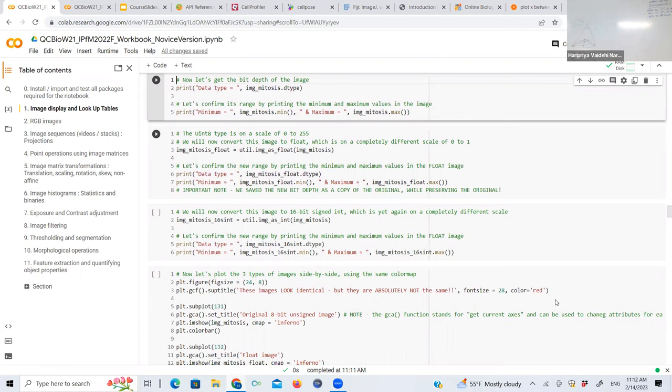If you Google for Matplotlib contour, it gives you the documentation for how to set the different threshold values, and you can essentially chop it wherever. This is just the default that's in the program. I didn't want to complicate it.